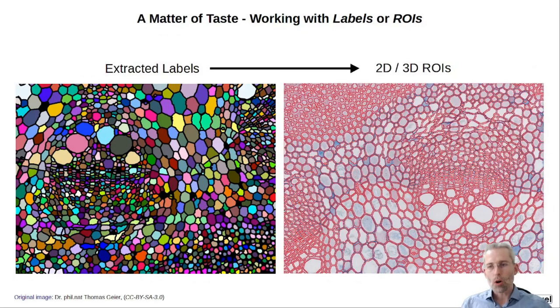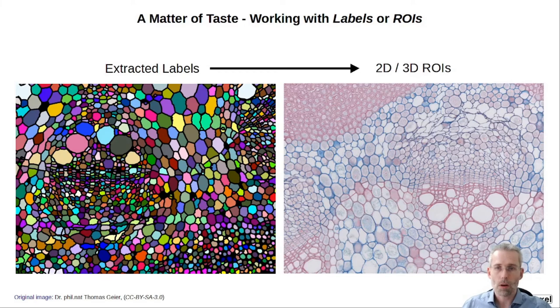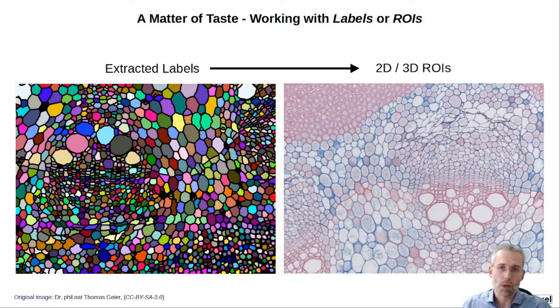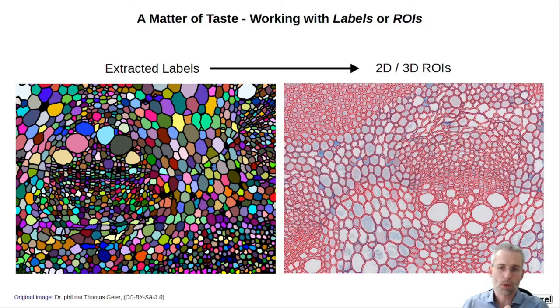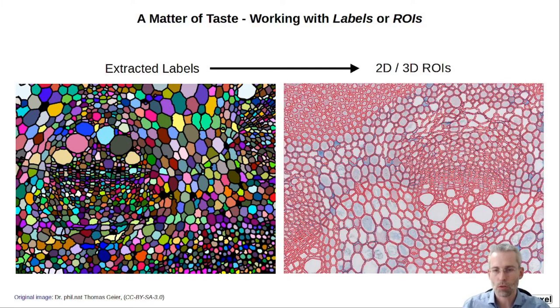Once we have our objects extracted it's a matter of taste if you want to continue working with the labels — for example via MorpholibJ or other tools — or if you want to convert them to ROIs. We have two functions: one, thanks to Ram van der Berg, which is a script reading labels into the 2D ROI Manager, and we can also use the 3D ROI Manager from Thomas Boudier to read out those ROIs and then continue working on them.